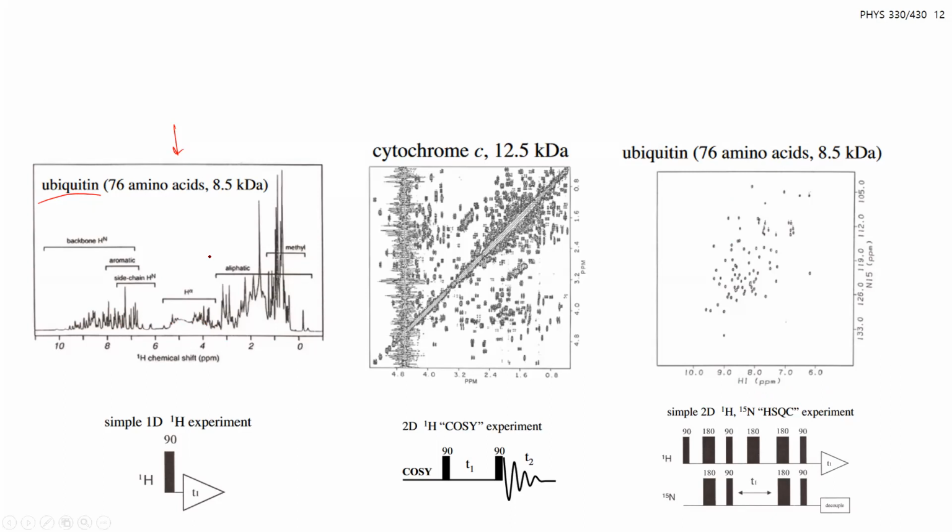If you have small changes in the structure of the protein, are you going to be able to resolve that with these broadened out heterogeneous peaks? And even if you do the homonuclear, this is H1 versus H1, proton versus proton, for still a very small protein, this is very difficult to interpret. There's a lot of overlapping signal, but this cleans up so much better. This is the same protein, ubiquitin, where you can find these individual peaks.